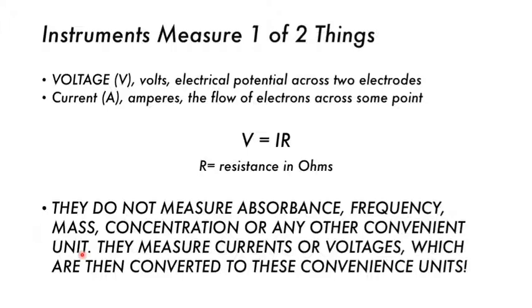Like before, the old school ones, they have those big weights they put on one side, and then the other side goes up and down, and then we have to add more weights and take them away. It's not like that. It's a physical measurement from before. This one makes use of electrical circuits.